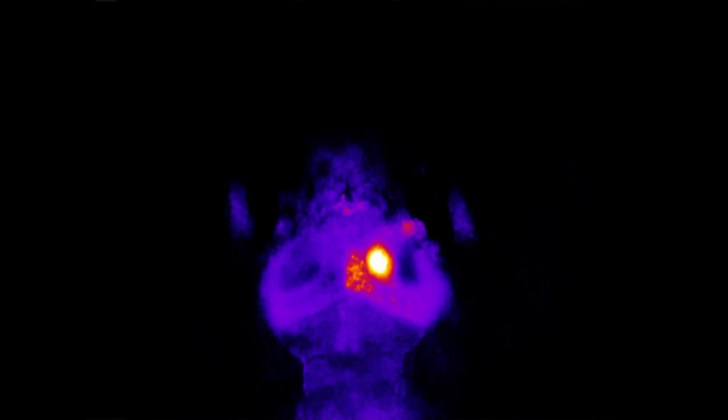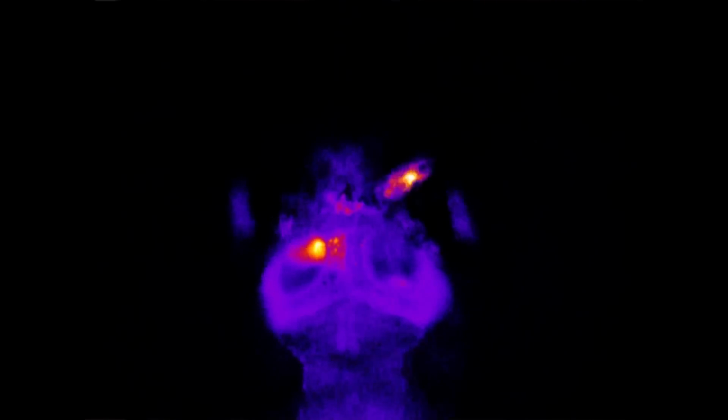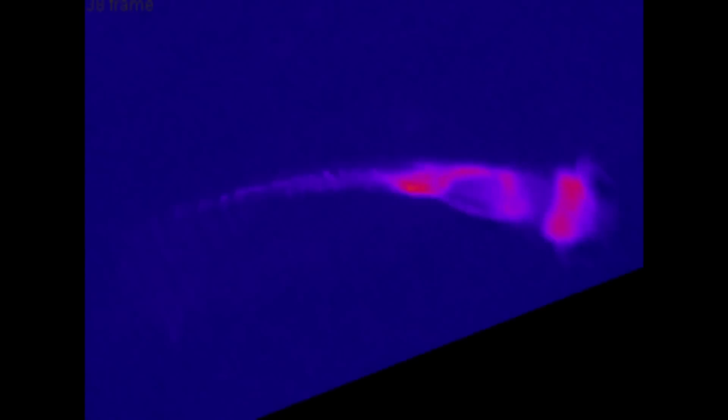Here's what you see in the recording. Changes in fluorescence intensity are shown in pseudo colors. Colors on the eyeballs are artifacts due to the image processing, caused by eye movements. Neuronal signals are observed in the optic tectum. We could also record from a free-swimming larva which captured a paramecium.